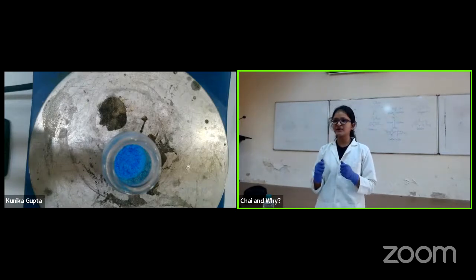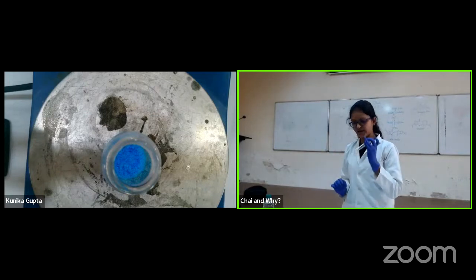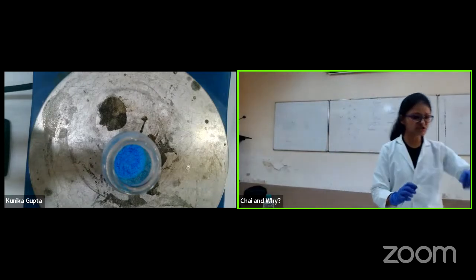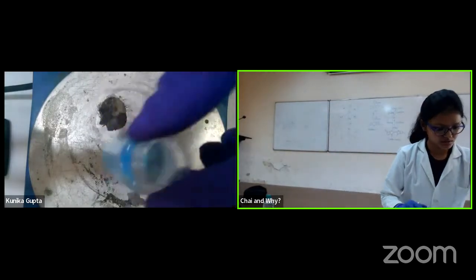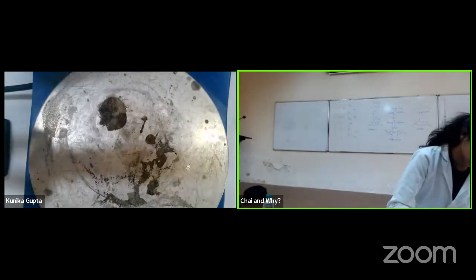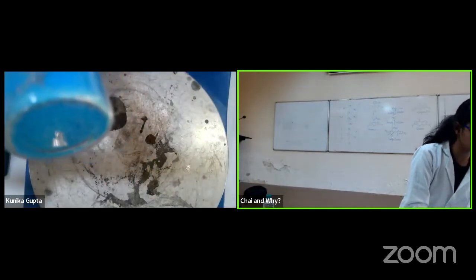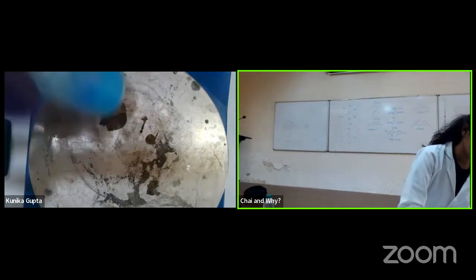So I'll show you an experiment with the dye. Okay, so how that works. I'll take an empty test tube. Again, I'll shift the camera. Wait, let's see if anything is happening. Yeah, it's happening very slowly. I think you should put it a very small pixel. If I show you the bottom, it may not focus. Let it heat slowly.